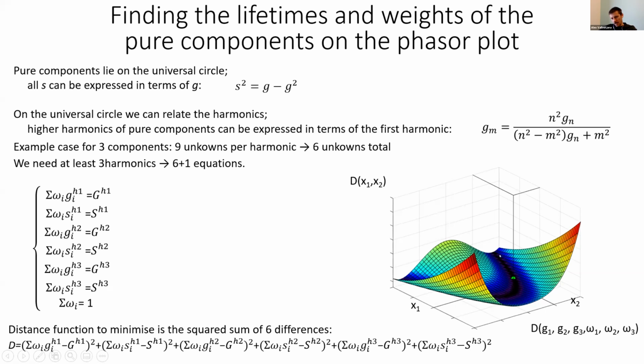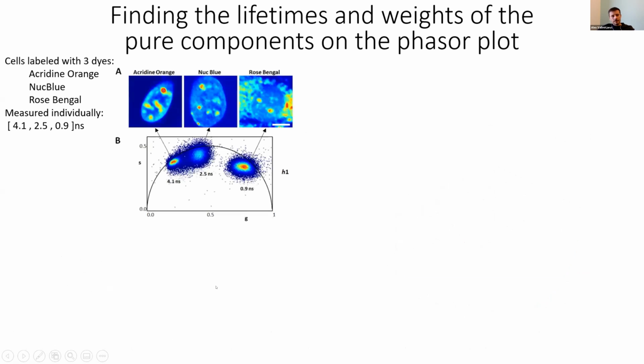As in the example that I'm showing you, you can already see you tend not to have definite points. You tend to have what we call the valley of solutions. So in general, it's not an easy problem, especially as you add higher harmonics.